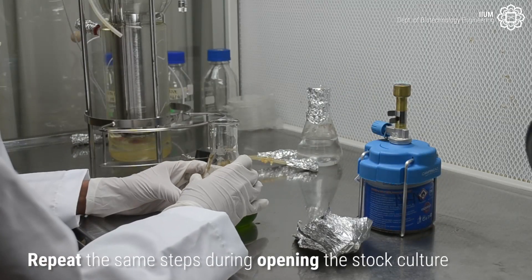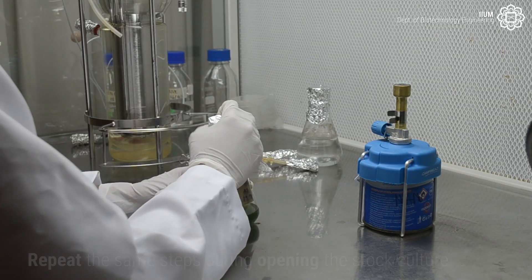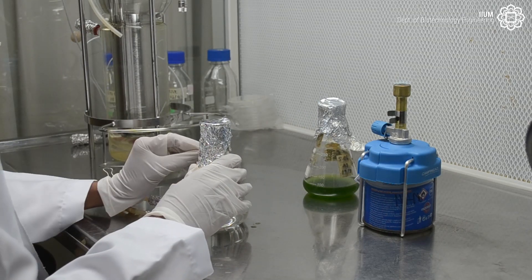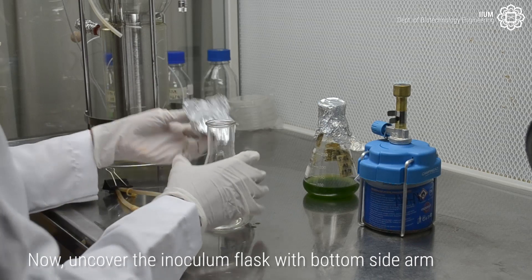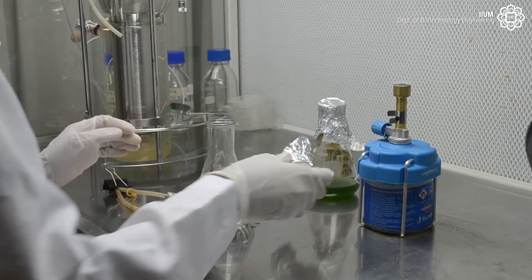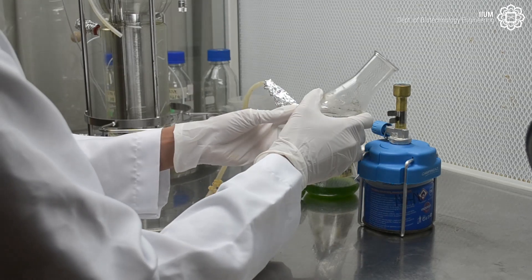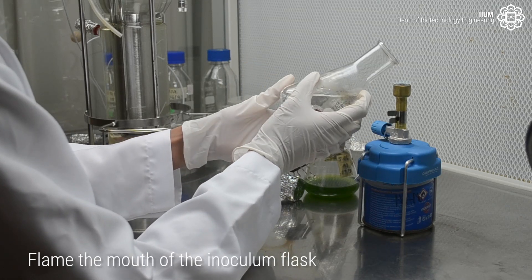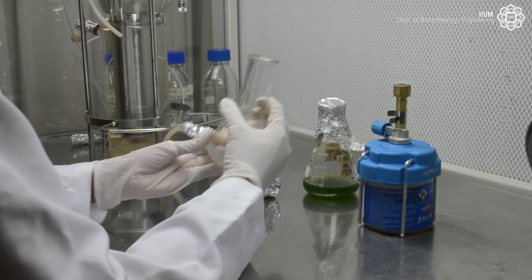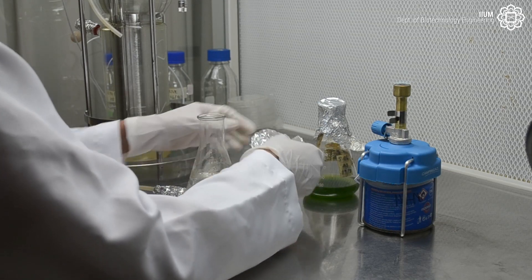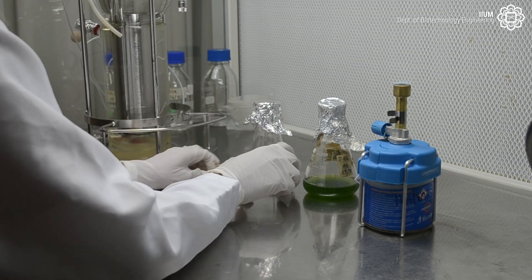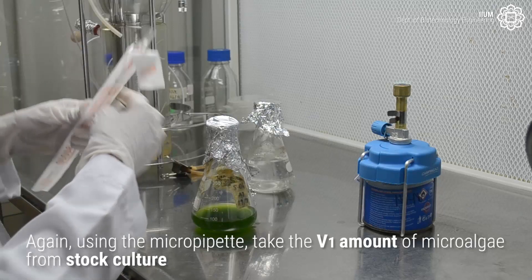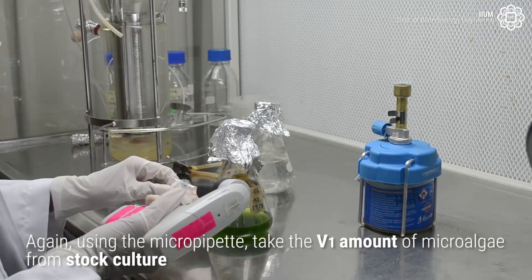Repeat the same steps from opening the stock culture. Now uncover the inoculum flask with bottom sidearm. Flame the mouth of the inoculum flask. Again, using the micropipette, take the V1 amount of microalgae from stock culture.